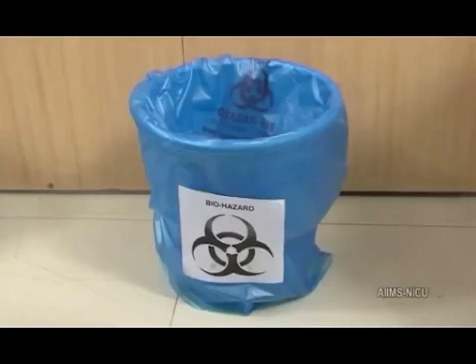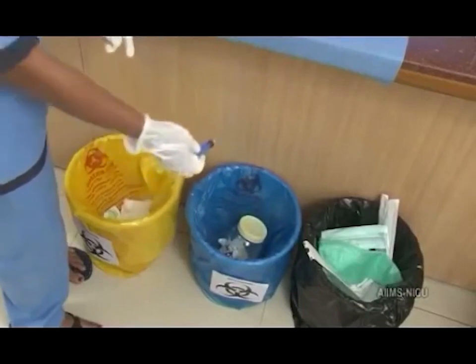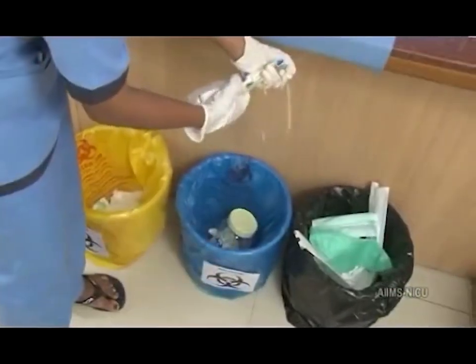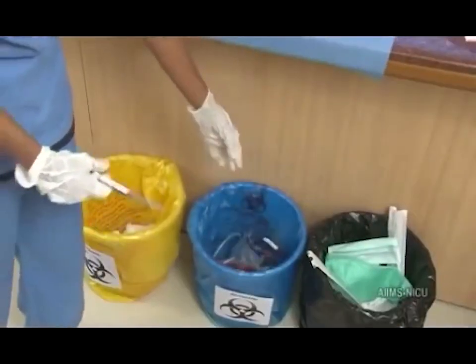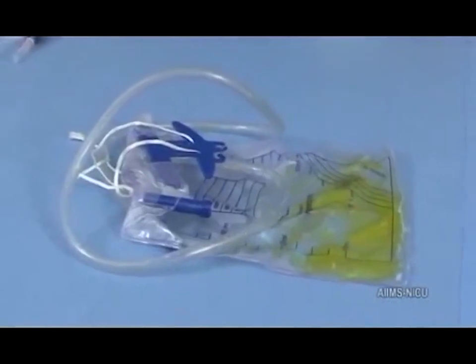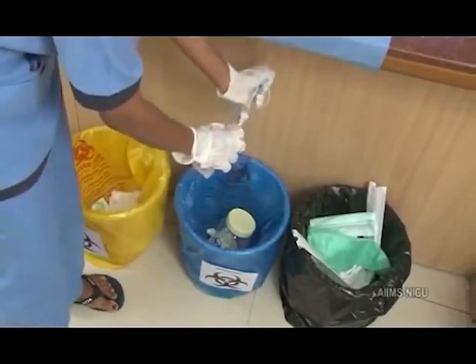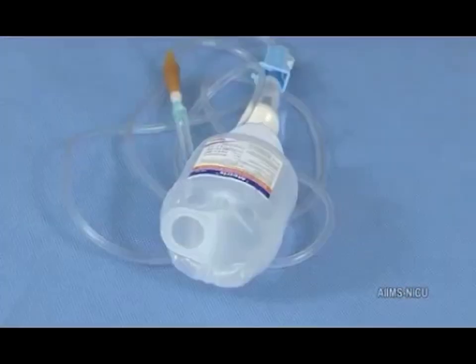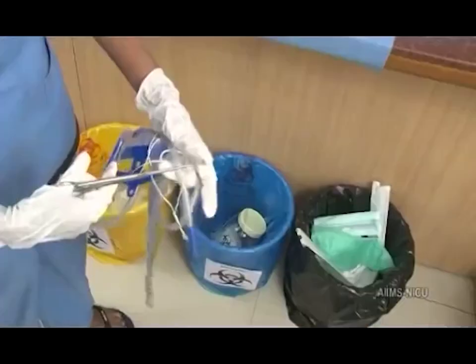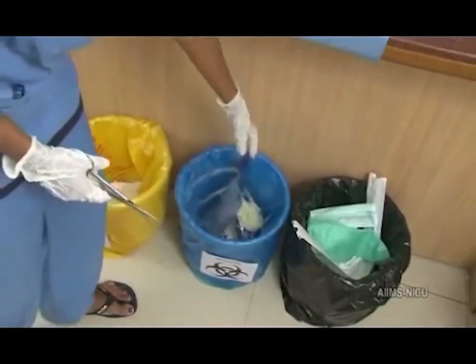The items to be disposed of in the blue bag include all the infected plastic waste, such as disposable syringes, the intravenous set, the blood transfusion set, the endotracheal tube, urinary catheter, urine bag, medication vials. The IV set, the blood transfusion set, the endotracheal tube, the catheter and the urine bag should be first cut into pieces and disposed of in the blue bag.